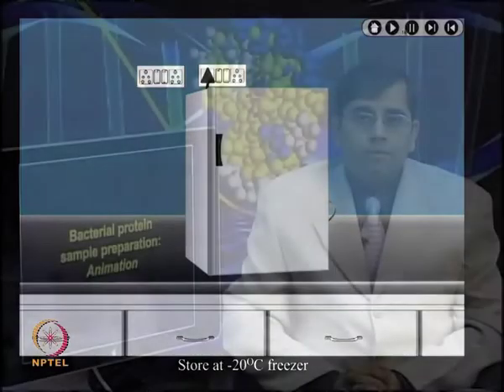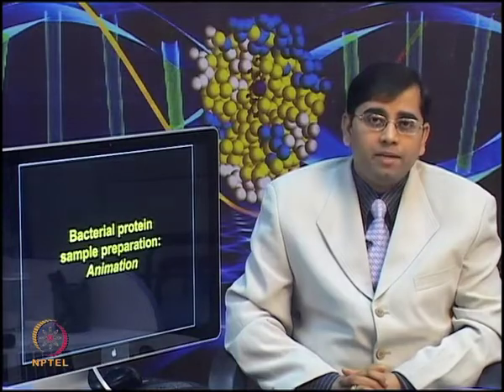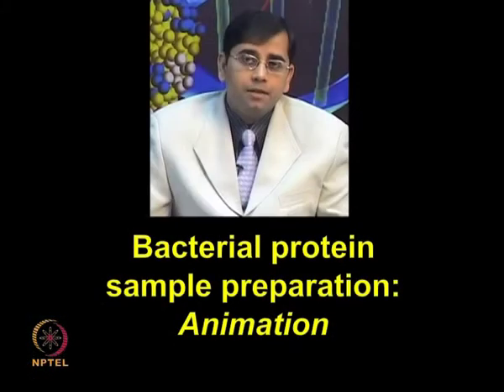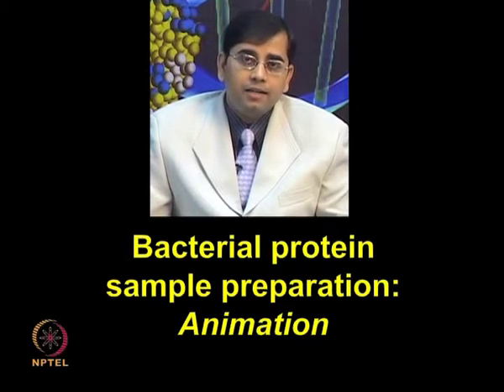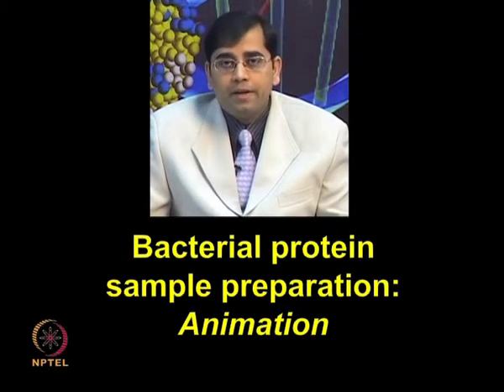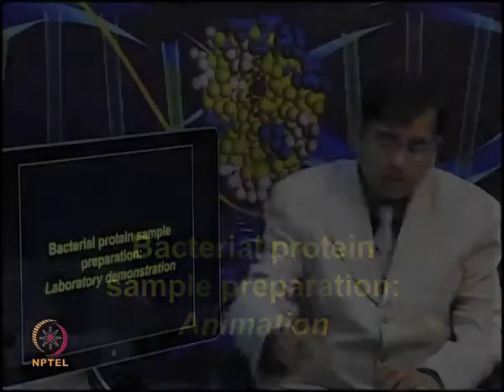bromophenol blue. Okay. So, I hope this animation was informative on bacterial protein extraction by using Trizol method, and you must appreciate that in this method you can obtain RNA, DNA and protein, all the biomolecules together.